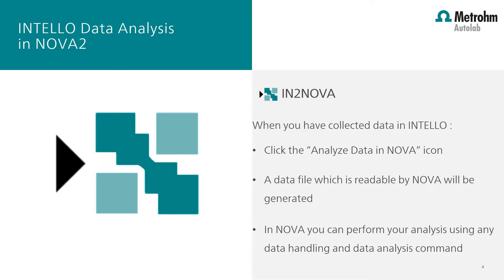Then an NOx data file is created which is readable by Nova, and once the file is created you can use any data handling and data analysis command in Nova to do your preferred analysis on this set of data measured by Vionic powered by Intello.